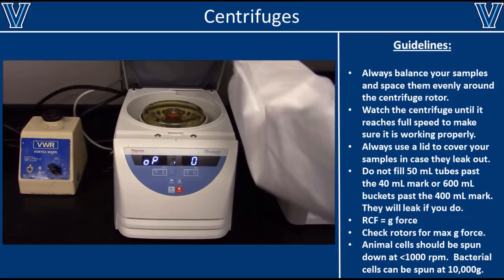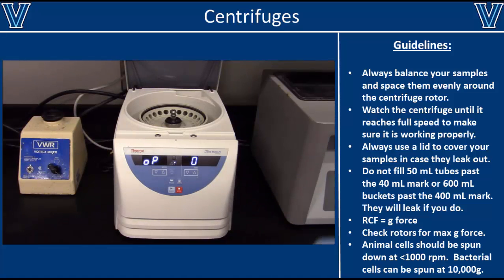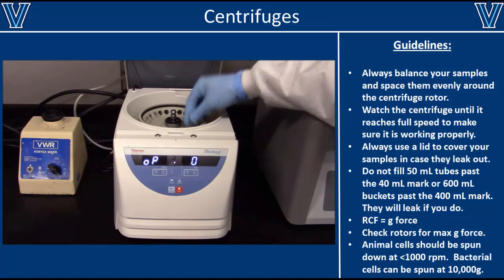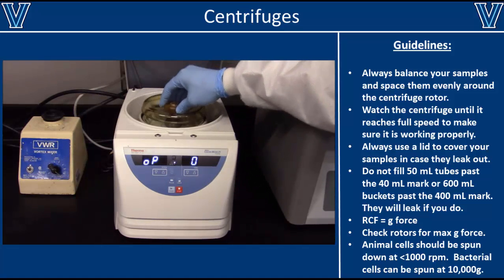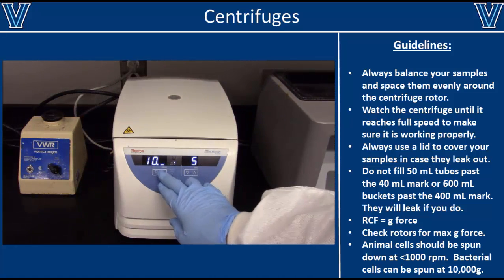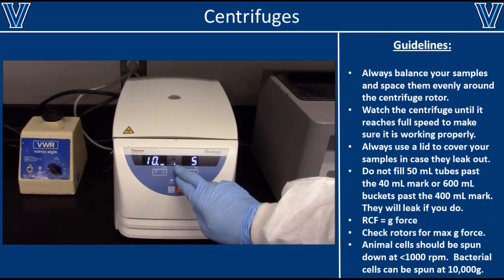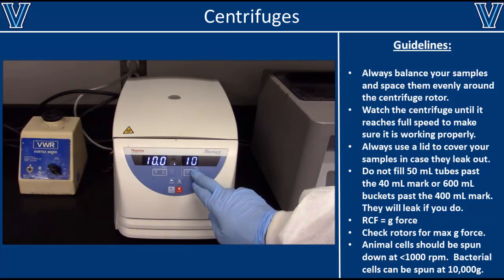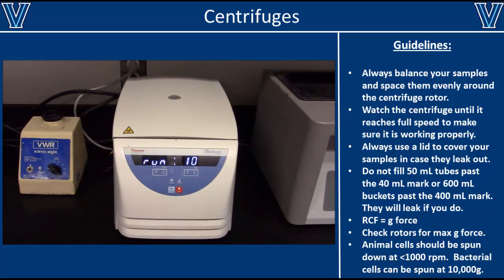If you ever have an odd number of samples, you can always use a tube of water to even things out. When putting your samples on the rotor, make sure they are exactly opposite one another, otherwise you'll get an imbalance error. Next, put a lid on the rotor just in case any of your samples leak out. To set the speed on the centrifuge, always begin by selecting either G-force or RPM for revolutions per minute. Note that G-force may also be shown as RCF for relative centrifugal force. Next, set the time on the centrifuge and start the run. You should always stick around to watch the centrifuge reach maximum speed just in case there's any kind of imbalance error.